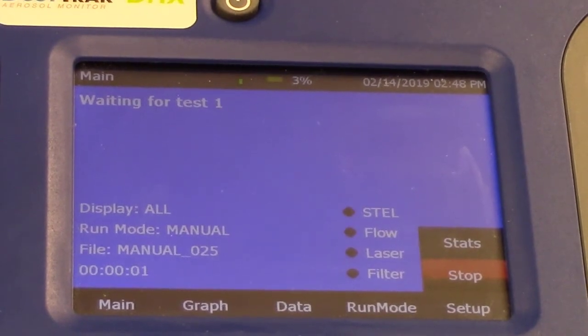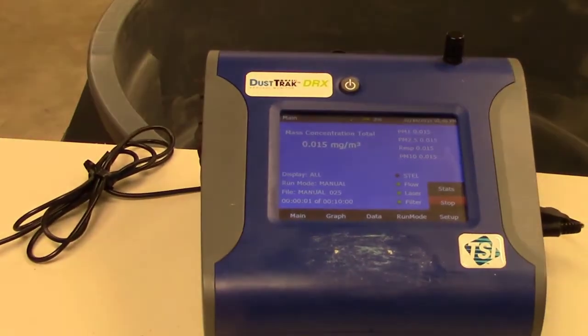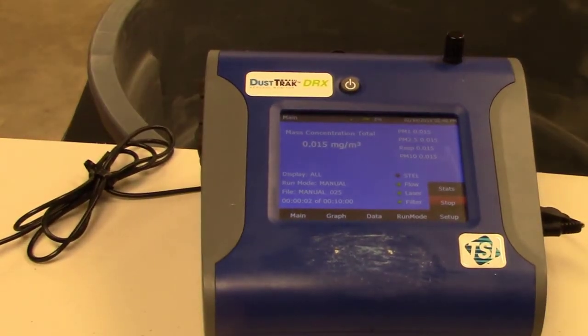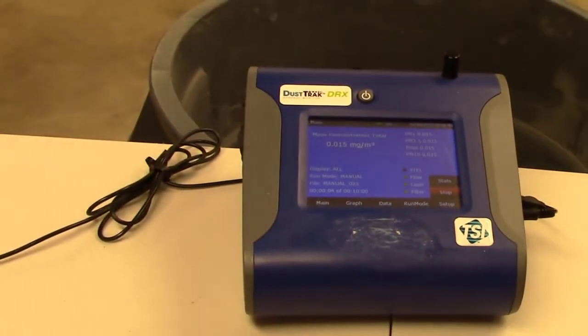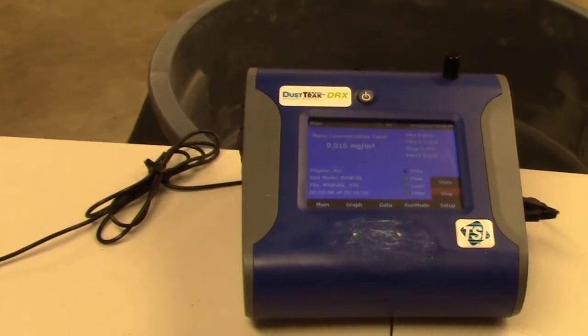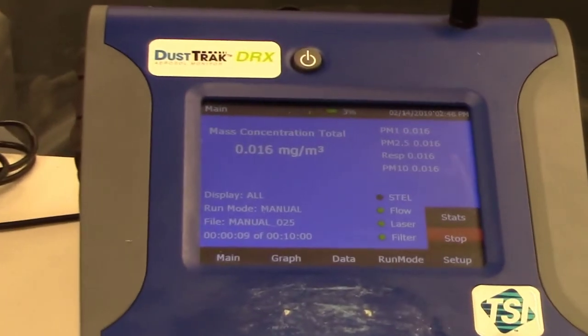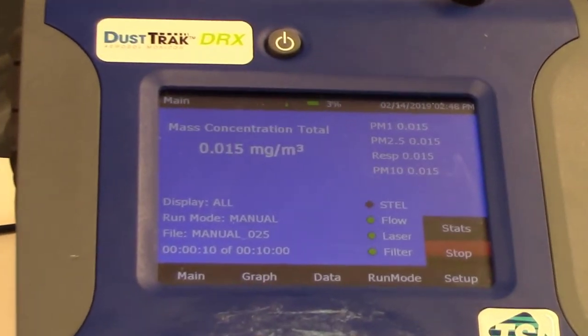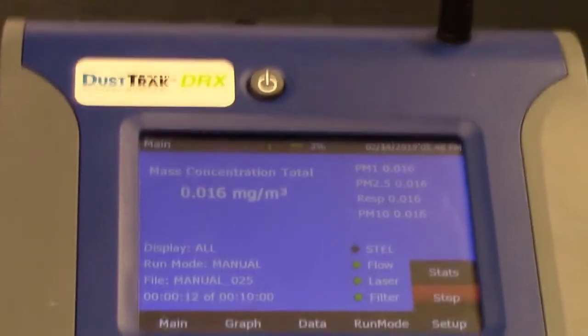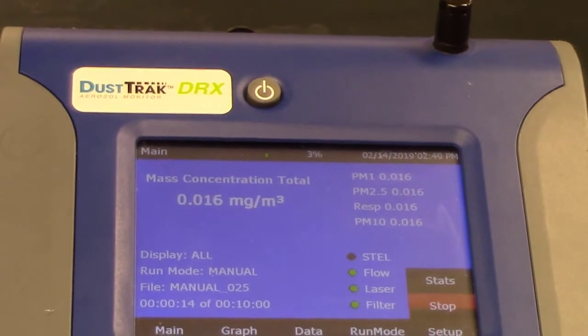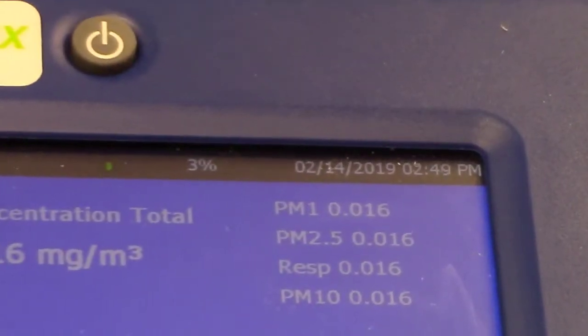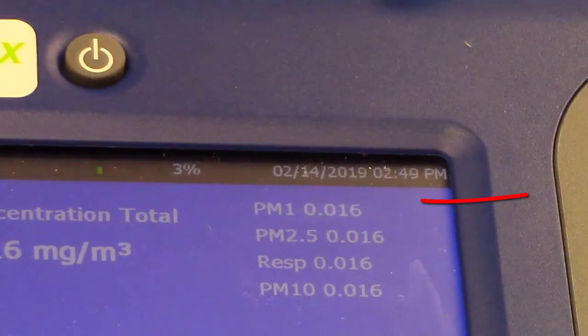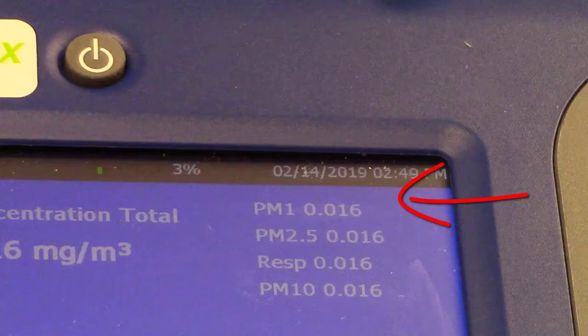One of the benefits of using a dust track is that it provides real-time aerosol mass readings while also separating data into different mass concentration fractions. As you can see on the top right corner of the instrument, it is showing mass fractions for PM1.0, PM2.5, the respirable fraction, and PM10. And as the instrument runs, these different concentrations are also displayed on the monitor.